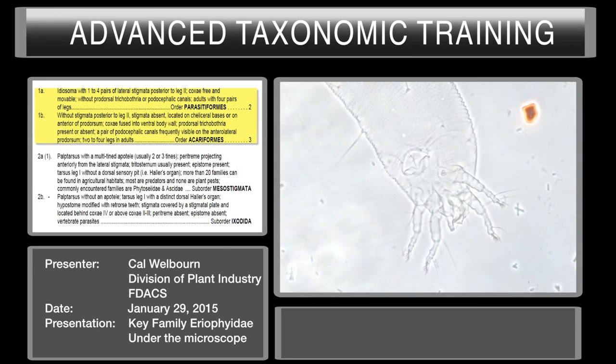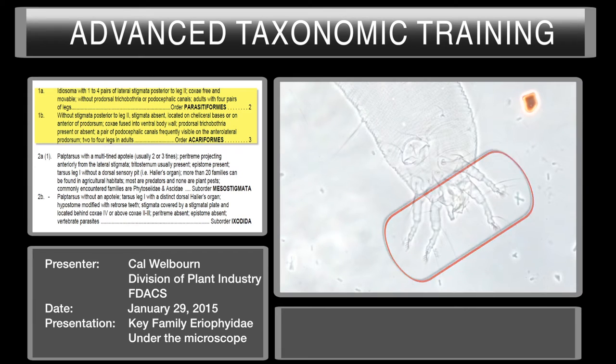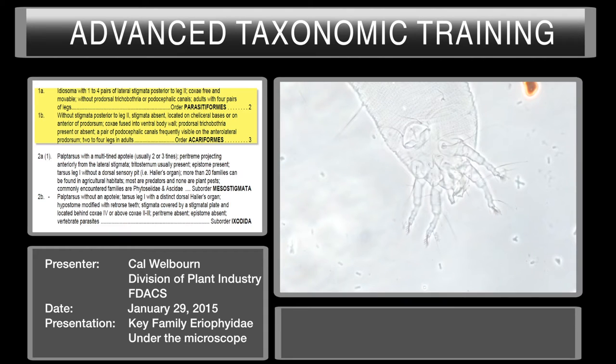We're under 40X right now, looking for one to four pairs of lateral stigmata posterior to leg two, cocci-free and movable, without prodorsal trichobothria, and adults with four pairs of legs. We can very clearly see right here there are only two pairs of legs. We need to look to see if there are any more legs further back — and we can see there are only two pairs of legs. So immediately, without looking at any of the other characters, we can eliminate the Parasitiformes. They all have four pairs of legs, the ones you're going to find.